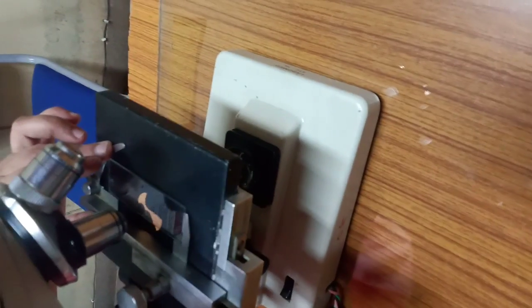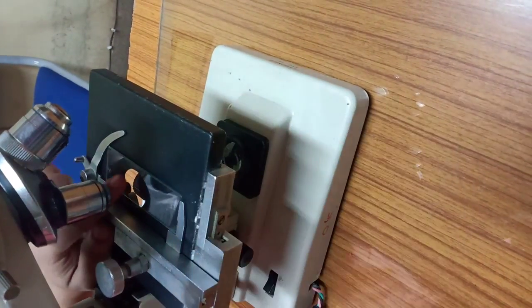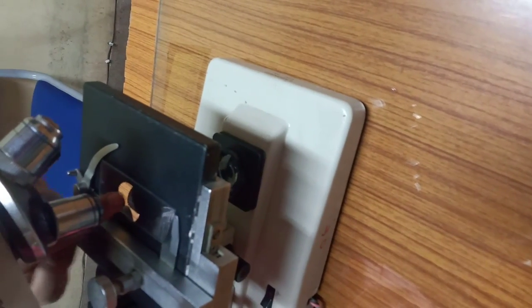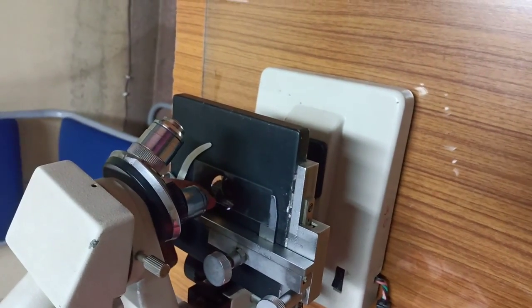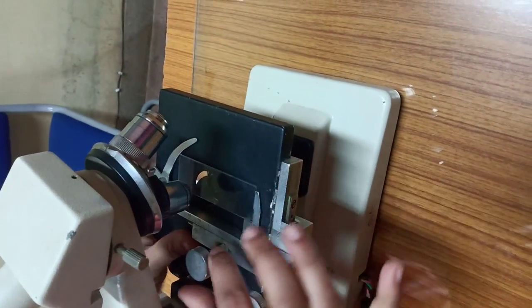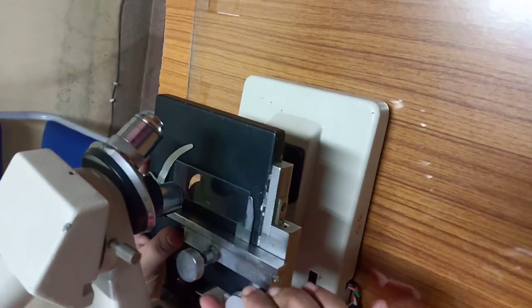Once you place it on the stage, you need to see that the place on the slide where the sample is should be exactly under the light and the objective lens. So you can move left and right, forward and backward to adjust the sample placed on the slide.